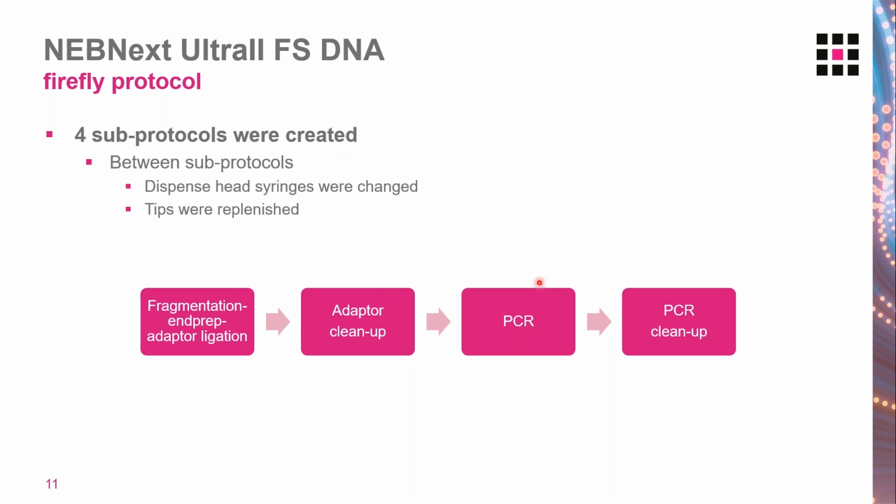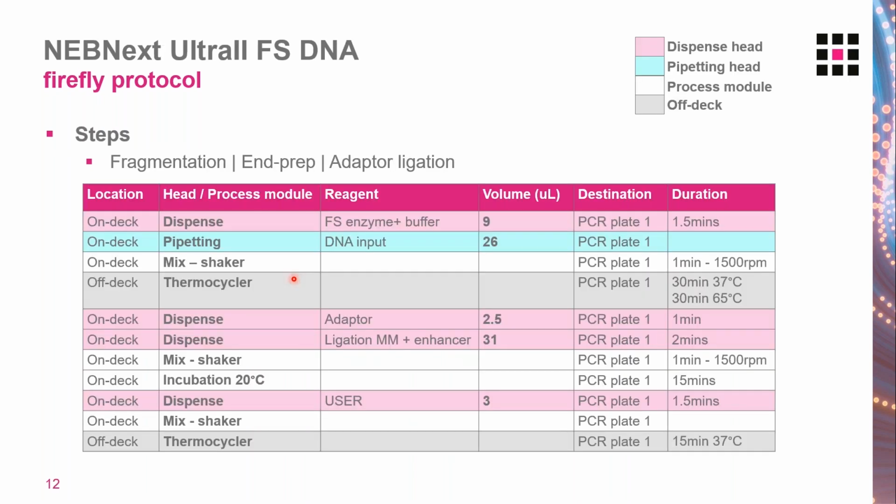These are the 4 protocols to be run on Firefly. Between each protocol, we are able to refresh our dispense head syringes and also replenish any tips for the air displacement head as well. This slide shows an outline of the first sub-protocol we prepared. It demonstrates how we can use the pipetting heads and dispense head and process modules all together to execute this protocol.